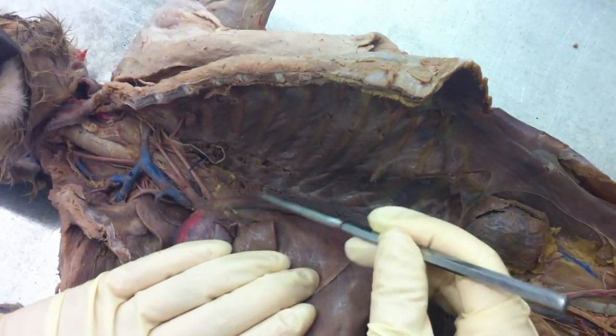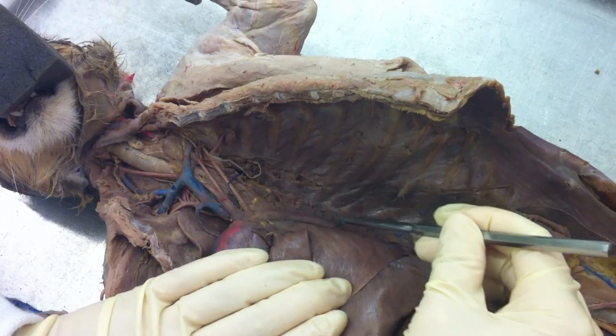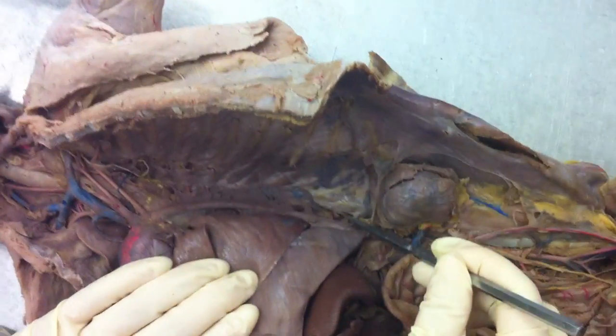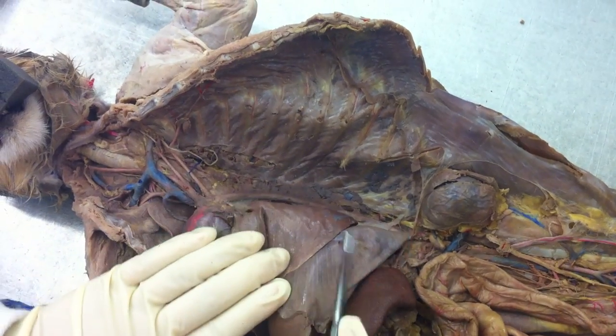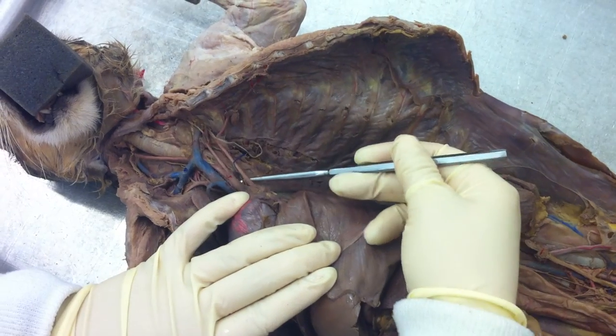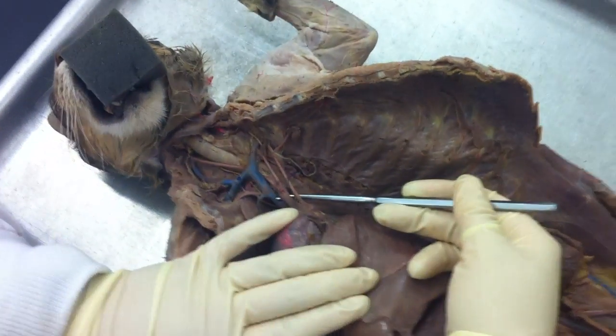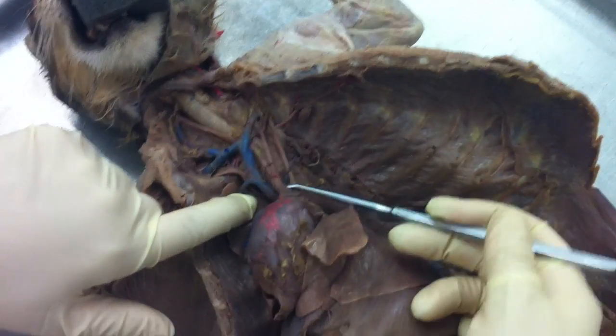This is the aortic arch, or the arch of the aorta, and then as it starts to come down, that is the descending aorta. Coming off of the arch of the aorta, we're going to have these two blood vessels right here. You get a big fat one, and you get a little skinny one. Let's do the big fat one first.